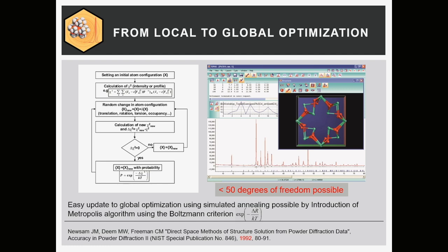What you do is, you fit the entire powder pattern, and as information, you take all the intensities you get, and from those intensities, where there is overlap, you have a factor which is describing the degree of overlap. In other words, if two peaks overlap by more than whatever, 90%, the two peaks are counted as one piece of information.